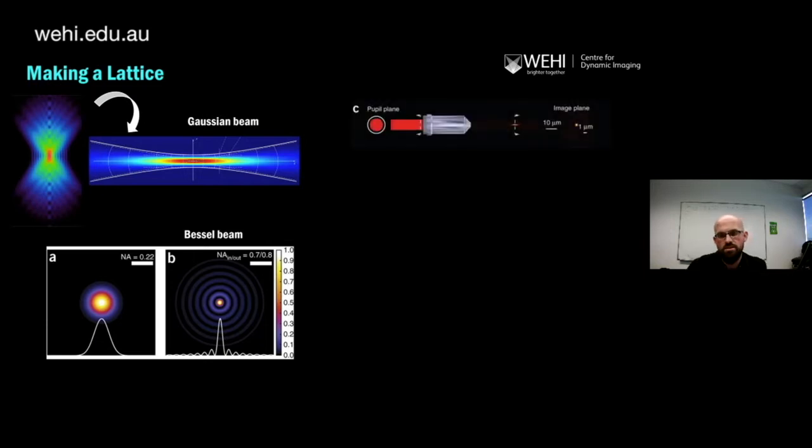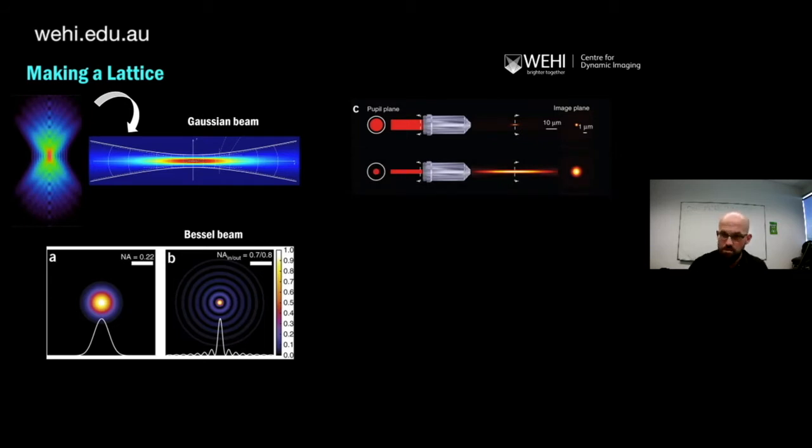And so in context of stretching out your Gaussian light sheet, you can get a very thin Gaussian light sheet, but it'd just be quite short. If you stretch that out longer, it gets a bit thicker, but with the Bessel beam, you can get the best of both worlds. You can get a long and thin, in essence, high resolution light sheet. The problem is these side lobes. So these side lobes still are light and interact and will give you out of focus light.